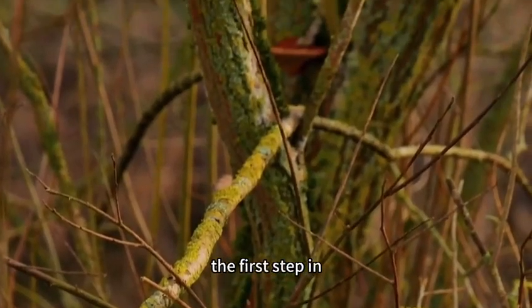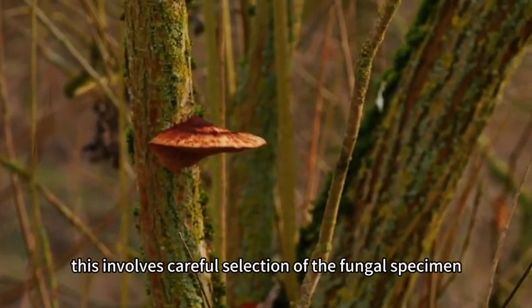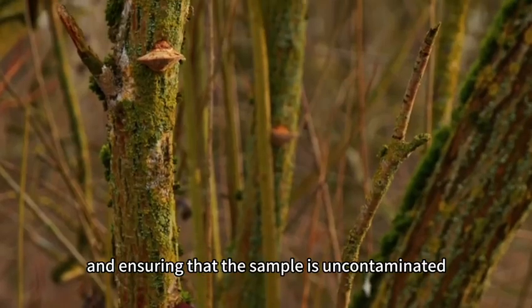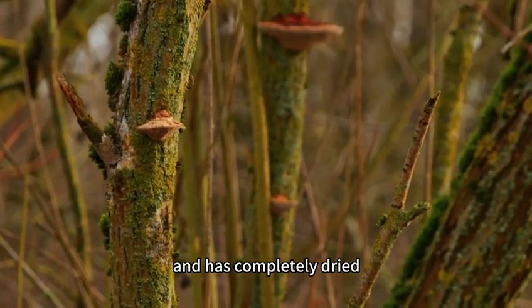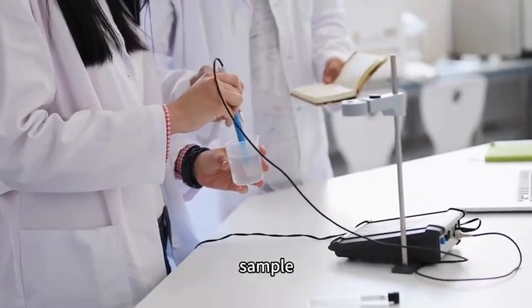The first step in identifying fungal DNA is collecting samples. This involves careful selection of the fungal specimen and ensuring that the sample is uncontaminated and has completely dried. How exactly do you get the DNA sequence of your chosen sample?